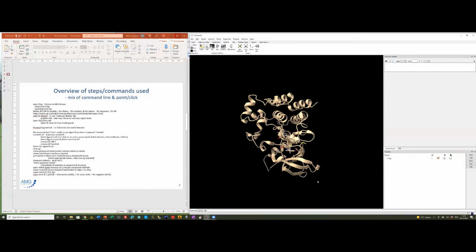So essentially we're going to create a copy of model 1, and you can rename these things so you can make things clearer as to where you are. So rename #1, and we'll rename that to the protein, and we'll rename #2 to the ligand, which is imatinib.